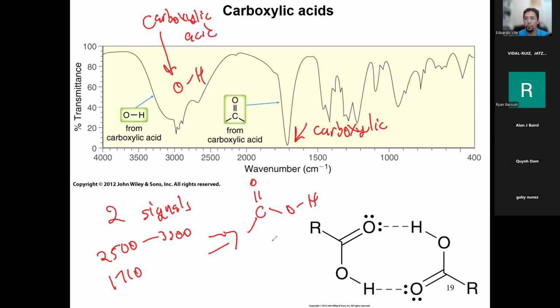So make sure you don't lose points, because you have to use very specific language to describe it. How do I learn the language? You practice. You do more spectra every day, more practice. From now on, there are going to be spectra in your lab worksheets, and of course they're going to show up in your final exam as well. So it's a good idea to be practicing spectra for the rest of the semester.